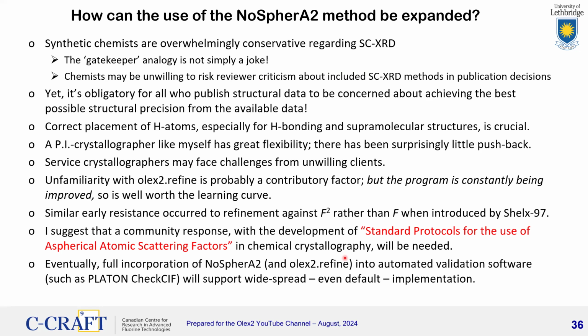How can the use of NoSpherA2 be expanded? I do think that not enough people have picked up on it yet. There's great potential here, and I think it's being underutilized at the moment. Some of the barriers might be, first of all, that synthetic chemists tend to be quite conservative regarding crystal structures. That gatekeeper analogy I gave you is not simply a joke. Chemists might be unwilling to risk reviewer criticism about the included structures that might hold up their publication or cause it to be rejected. So that is a serious worry.